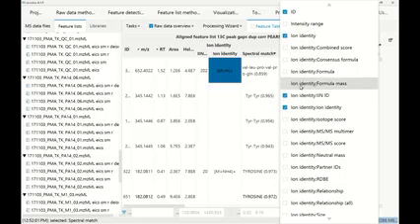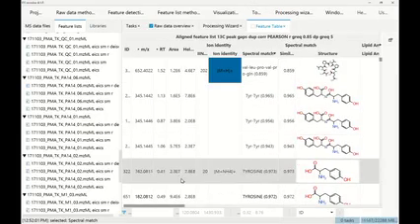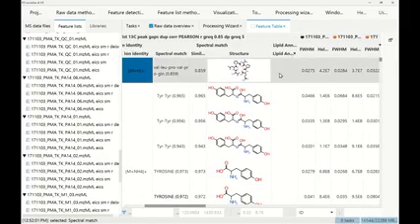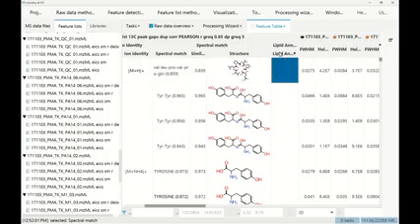Yeah. So there was a question about the lipid annotations, and this dataset was not a lipid dataset, so sadly we don't actually get any lipid annotations here. But lipid annotation works mostly on fragmentation rules. So we're not searching a database, but we're generating our own database basically, and then using fragmentation rules for different lipid classes. So you can set this up in the batch.